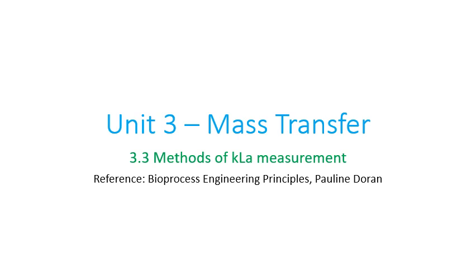There are a few empirical formulae available for the measurement of KLa. But it's always very tedious to look for empirical equations and calculate the value of KLa from them. We'll discuss the various empirical formulae during the next class. For the time being, let's just say there are a few empirical equations available for the calculation of KLa, and it's very difficult to calculate from them. Therefore, we can measure the value of KLa from the experiment or from the fermenter directly. What methods we can use to experimentally determine KLa is what we're going to see next.